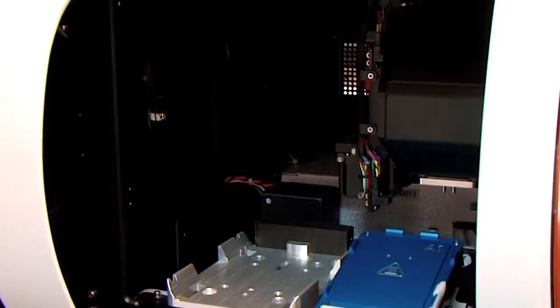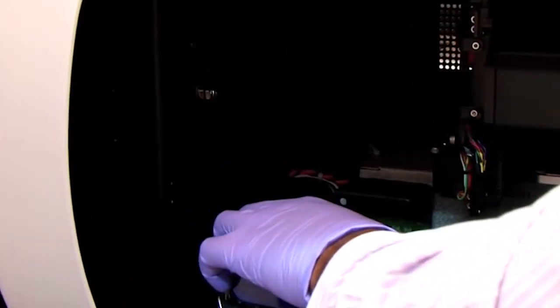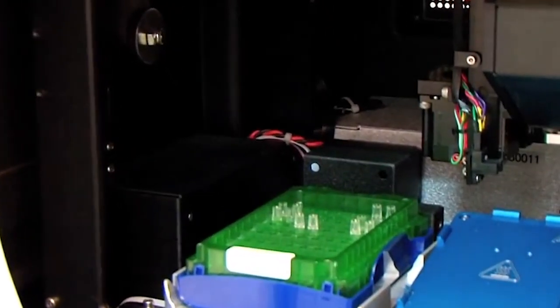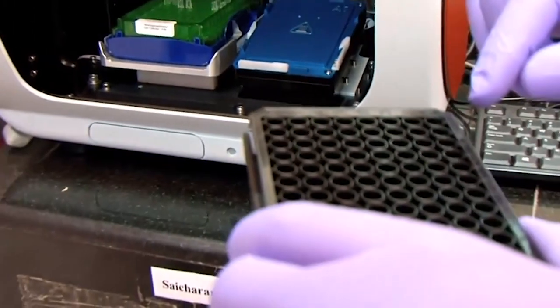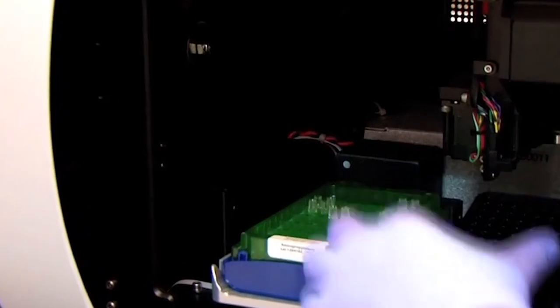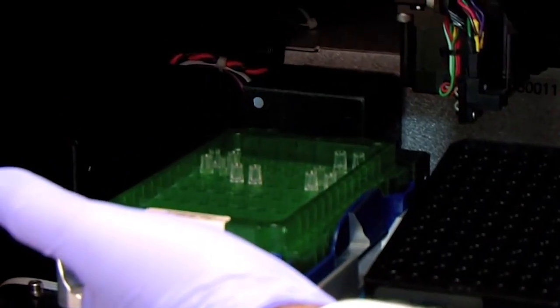Now the sensors are hydrated. I'm going to place them in the instrument. The sensor holder I'm placing here like this. It should be firmly fixed in the groove. And now I'm going to put the sample plate which contains the biotinylated antibody, and I'm going to place it like this in the sample tray. This particular part we call the sample compartment. This part we call the sensor compartment.